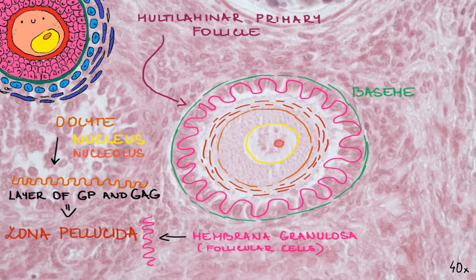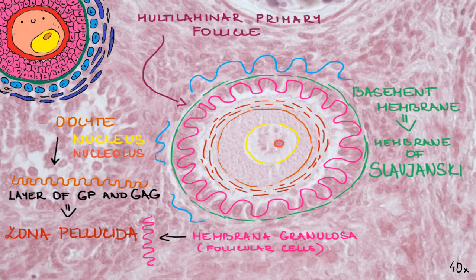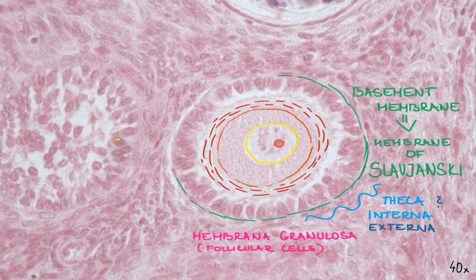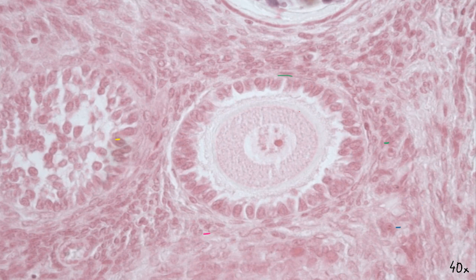The basement membrane located under follicular cells is very well developed. As soon as the follicle reaches the multilaminar stage, we call it the membrane of Slavyansky. Loose connective tissue around the follicle starts differentiating into two layers: theca interna and theca externa. Although we can see them here, they are much better developed in the late stages of the follicle, so we'll have a look at them later.